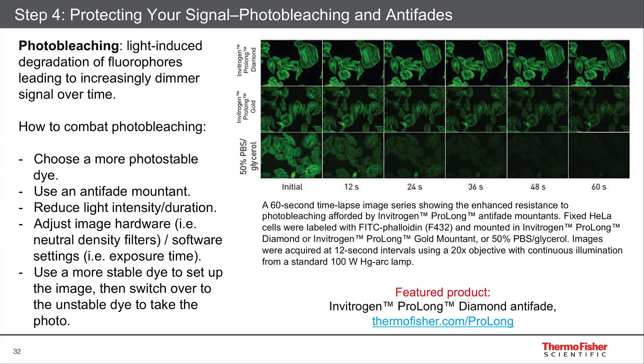If you use a traditional microscope, you might even throw in a neutral density filter while you find cells of interest. Now, if your dye is just so sensitive that it photobleaches away really quickly, even in an antifade, then you might want to consider having a second dye — like DAPI, for instance — that you can use to find your cells and set it up, and then you quickly switch over and take the image in the dye that's not as stable.